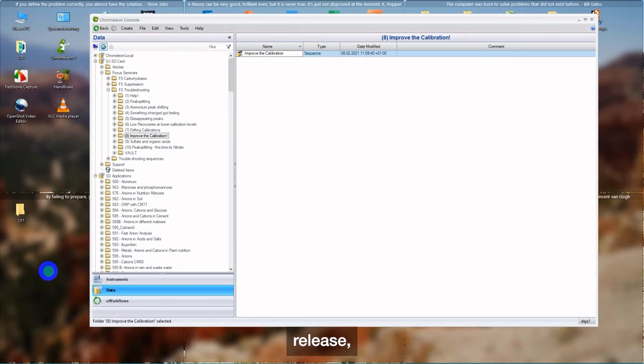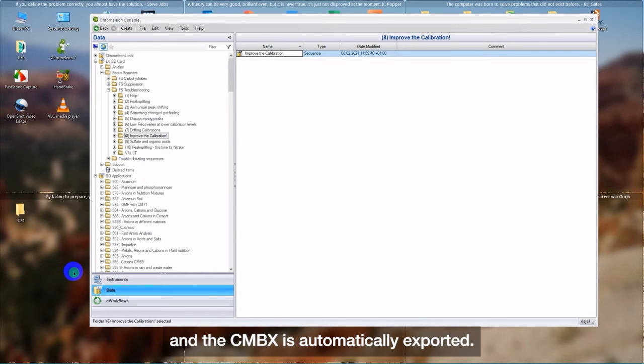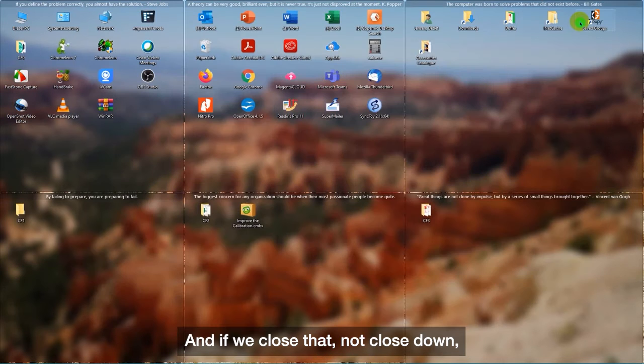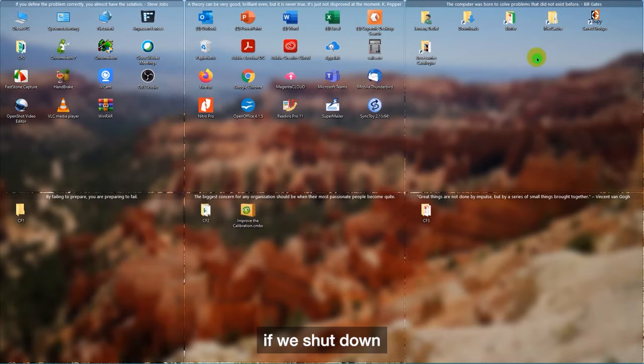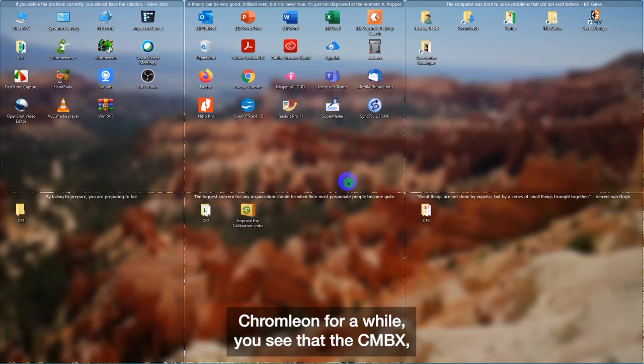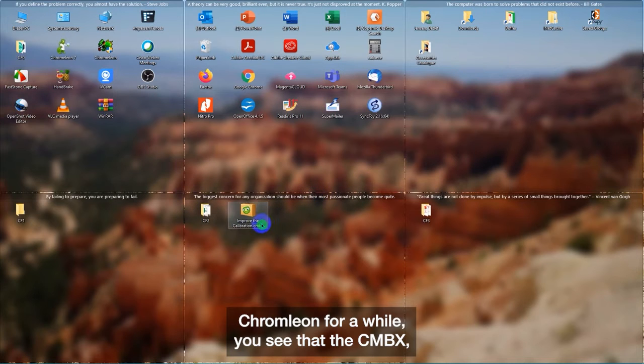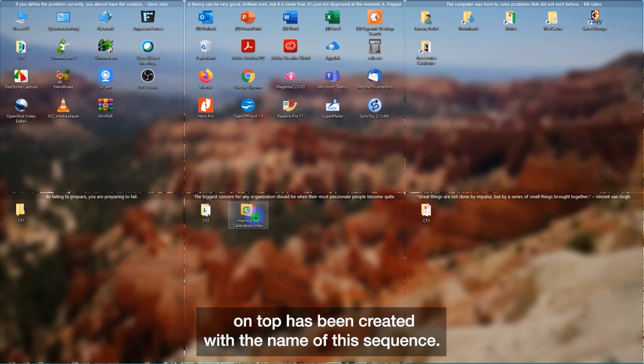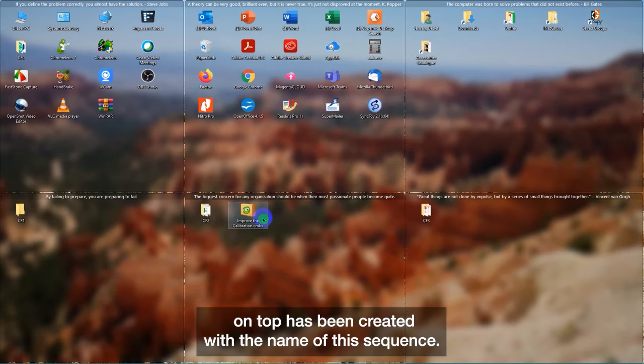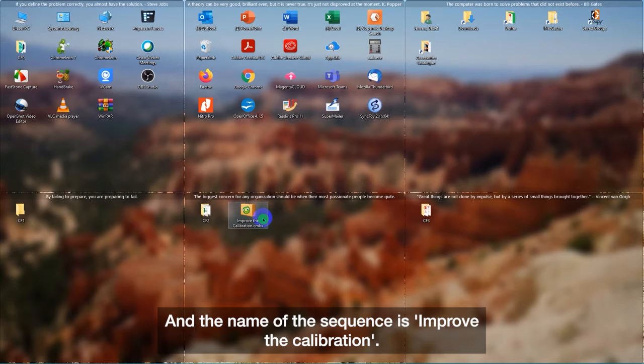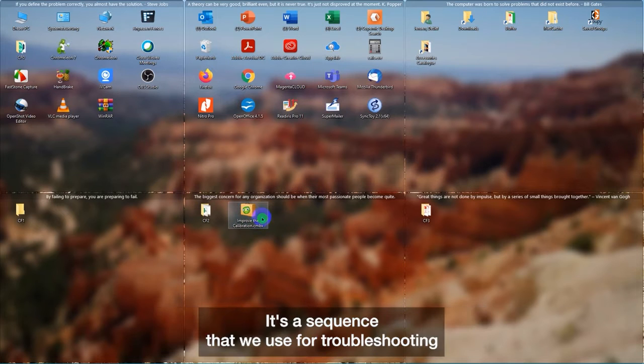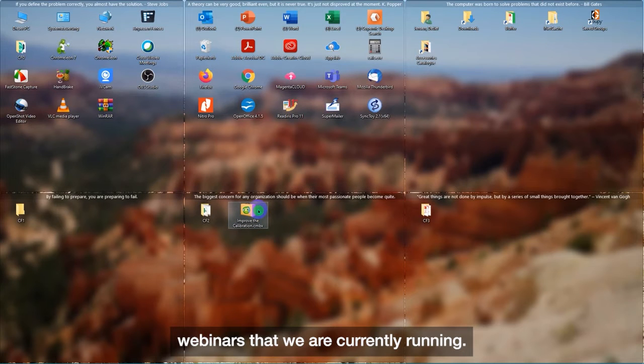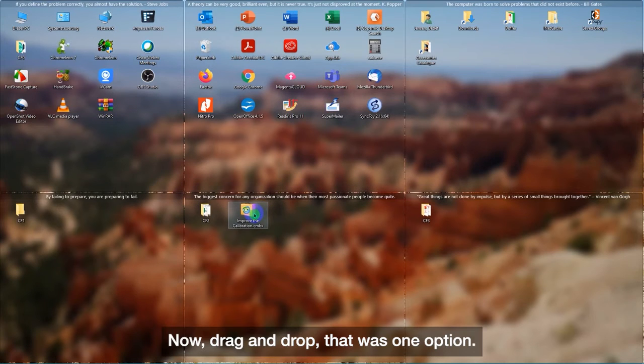Release and the CMBX is automatically exported. And if we shut down Chromeleon for a while, you see that a CMBX, that's a little suitcase with Charlie Chromeleon's face on top, has been created with the name of the sequence. And the name of the sequence is improve the calibration. It's the sequence that we use for troubleshooting webinars that we are currently running.